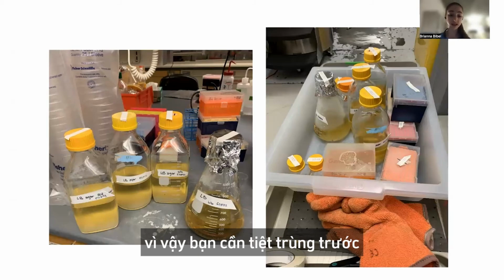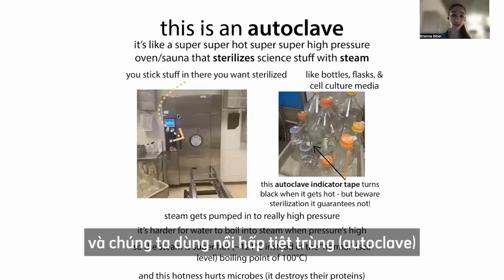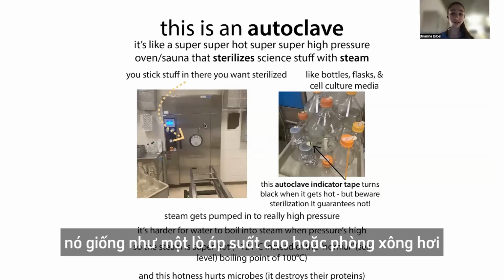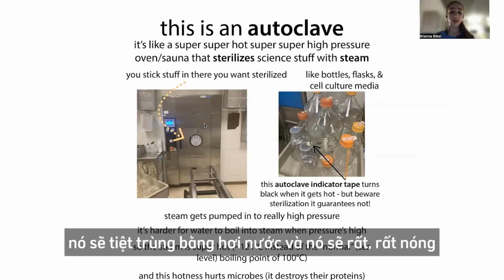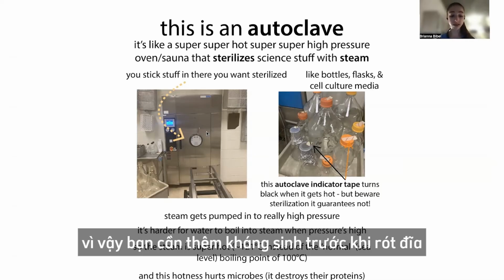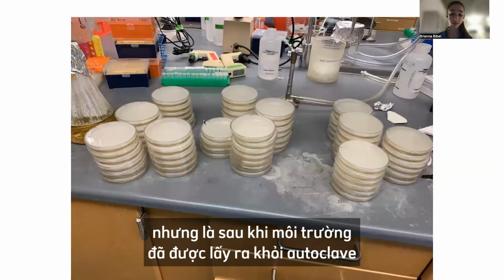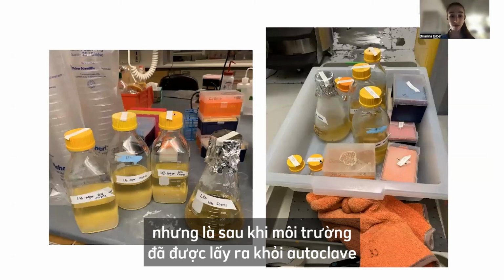So we use an autoclave, which is like a super high pressure oven or sauna. It sterilizes stuff with steam, and it gets really, really hot, which would totally kill your antibiotics. So you're going to want to add them before you pour the plates, but after the media comes out of the autoclave.